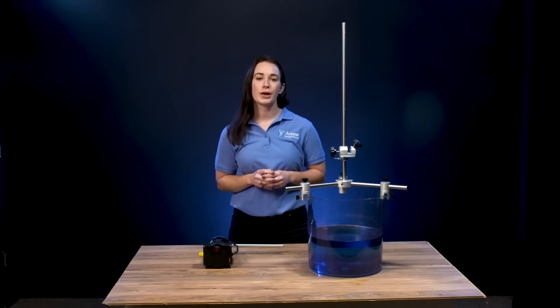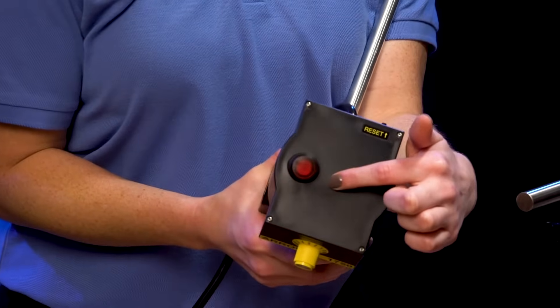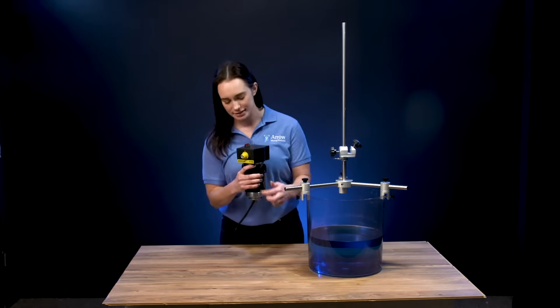Before attaching the stirrer, make sure the on-off switch at the top is angled toward the front. This indicates that it's in the off position. Also, make sure that the yellow speed dial is at its lowest setting.